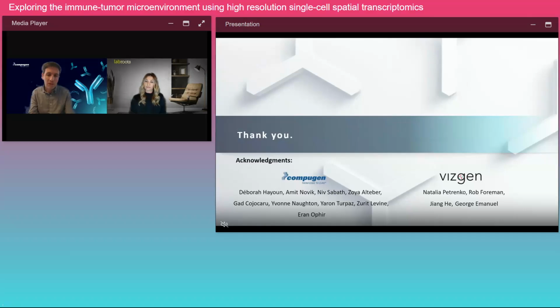In Compugen, we're focused on studying novel genes. So I believe that in Xenium, you start with an established panel, then you can only add a few genes, if I'm not mistaken. So for us, it's good to have the ability to design the panel from scratch. So for now, I think we'll stick with Vizgen, but we're open. We keep looking at the relevant technologies, and definitely we aim to increase the number of genes we're detecting because it's really important.